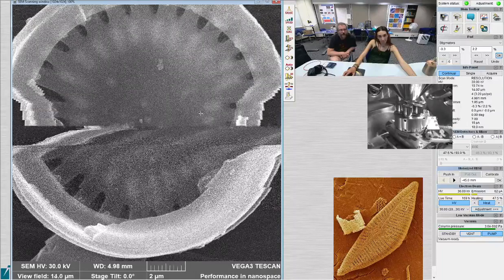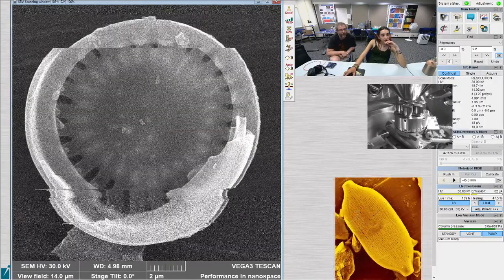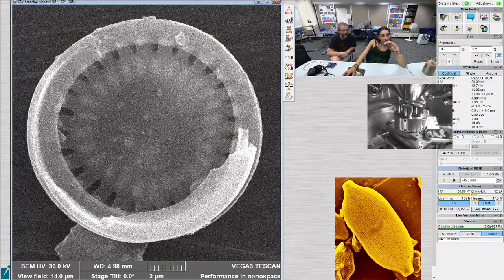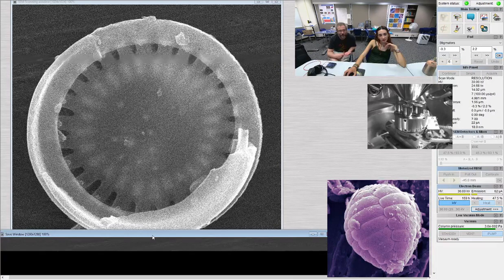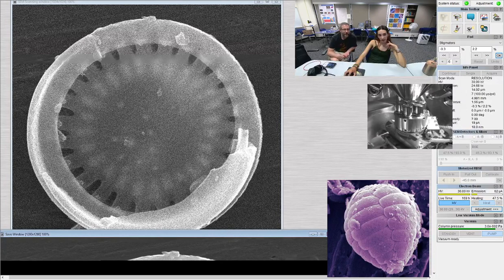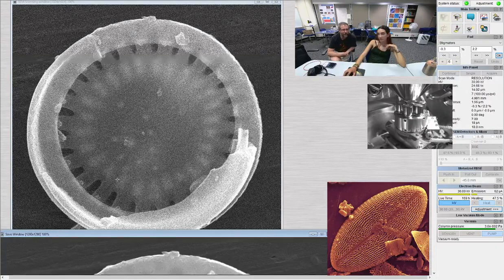But most typically, it's combinations of characters. So you can usually get things into genus, for example, based on, like, I can tell this is cycloteloid because, one, it's circular, two, it has mantle fultoportulae and costae and alveolar chambers. Those are the alveolar chambers there. And those shadow things, I'm not sure exactly what they are. They're thin bits of silica, so I'm a little confused by what they are exactly.